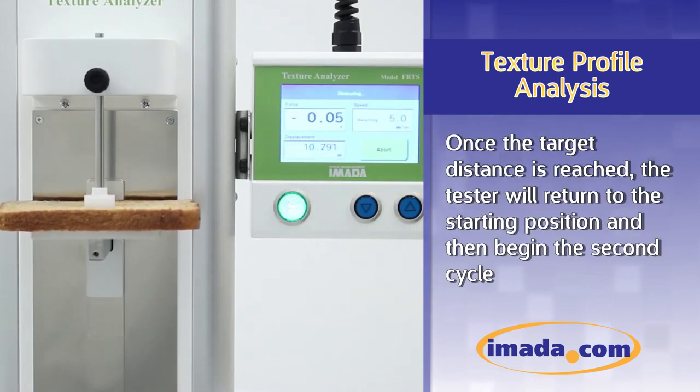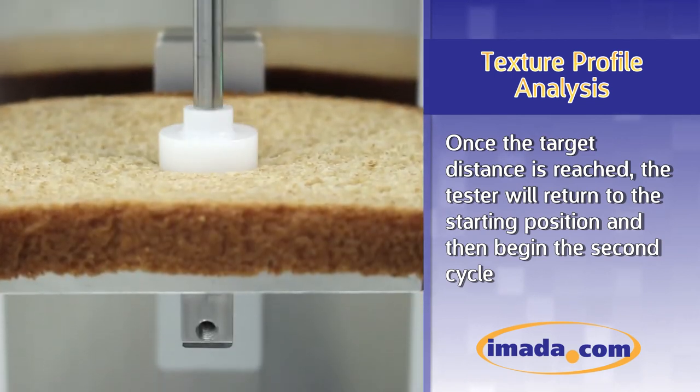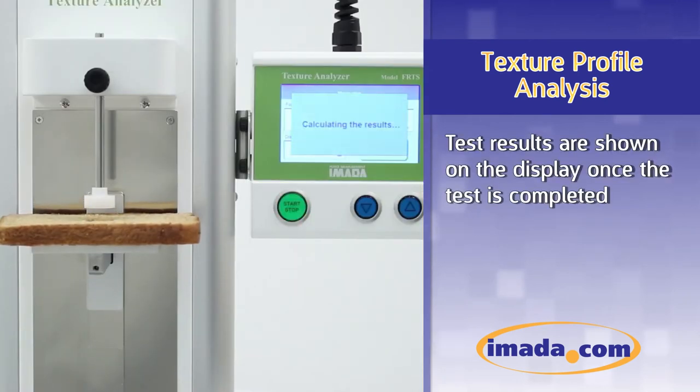Once the target distance from the sample table is reached, the tester will return to the starting position and then begin the second cycle. Test results are shown on the display once the test is completed.